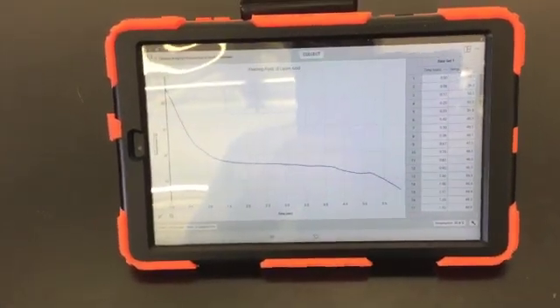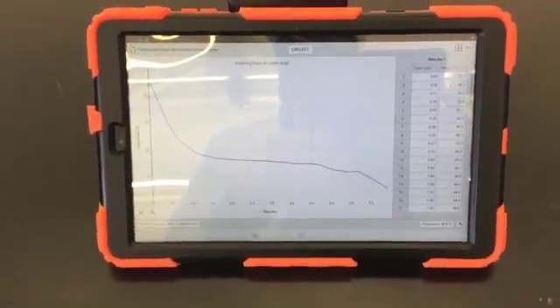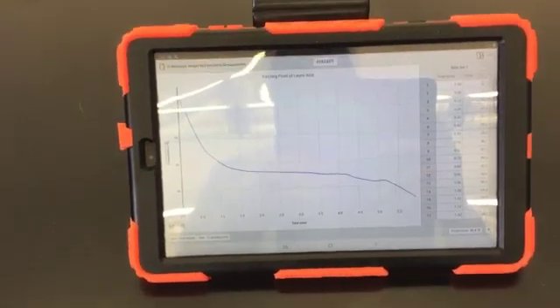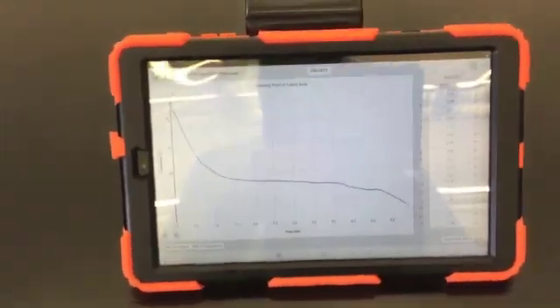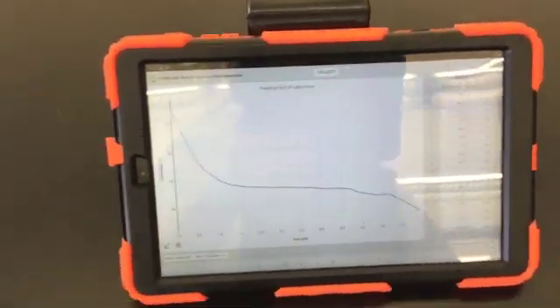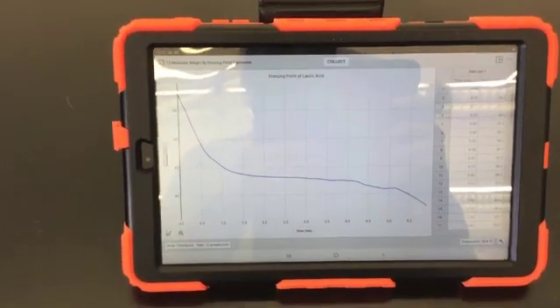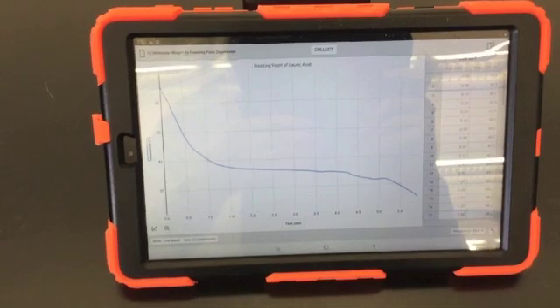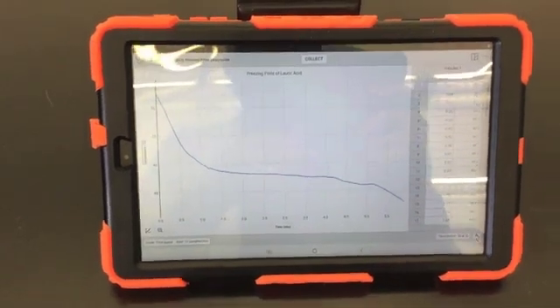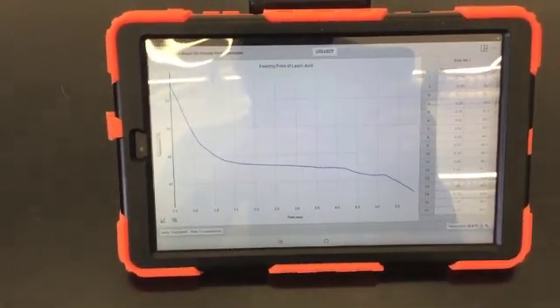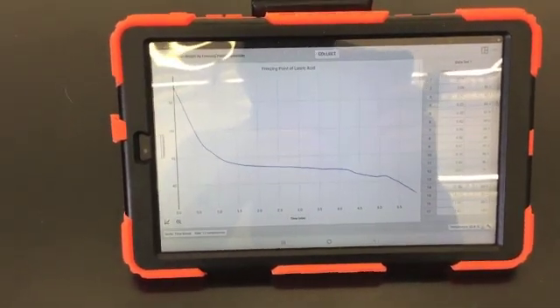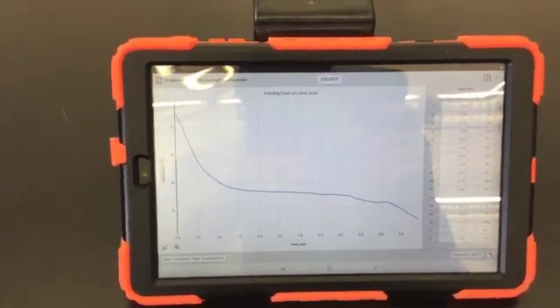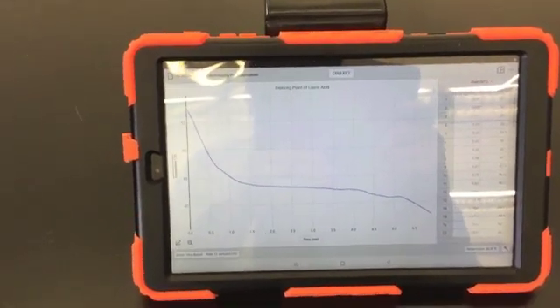Once you've collected your data, it is time to find the melting point. Recall that we are going to need to have two lines intersecting. One line will be for the cooling portion of the first part of the graph and the other for the flatter region. You can see that even though it should be a very flat and zero slope, it isn't exactly. So we're going to need to extrapolate to a data point that wasn't collected.